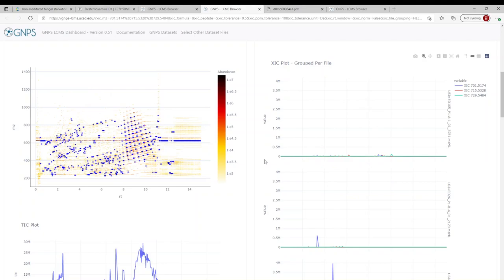And really, the last thing I want to show is beyond the evaluation of knowns, we can also easily visualize and allow for prioritization of extracts when hunting for unknowns. This is an essential process in natural products.